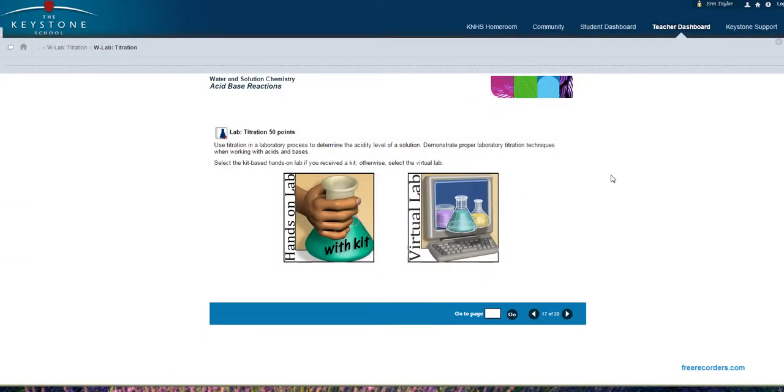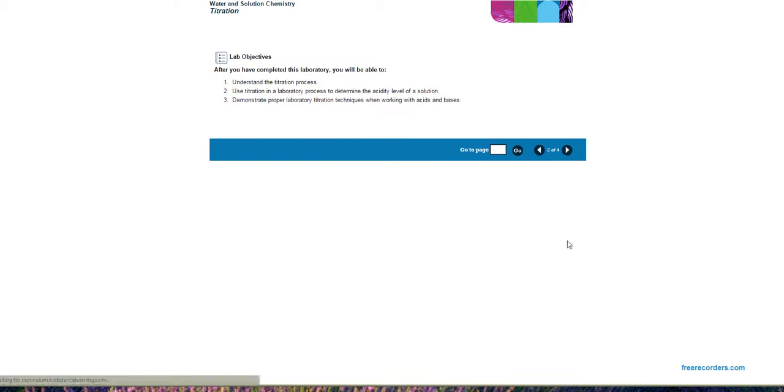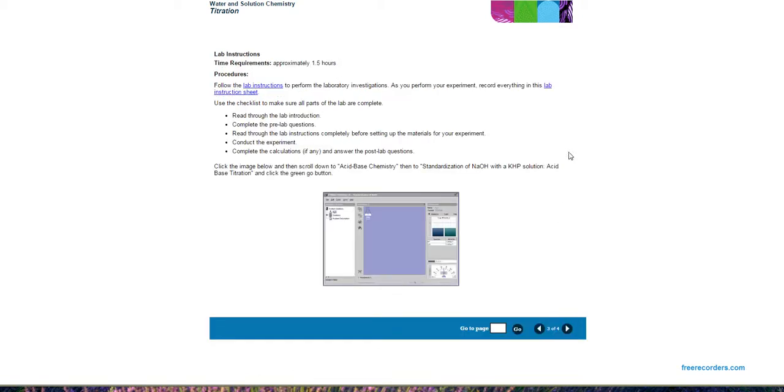Hello, this video is to help you with the virtual titration lab. So let's get started. If I click on my virtual lab, let's navigate through, read all of the introduction slides, the objectives, and I'm going to help you with the instructions.